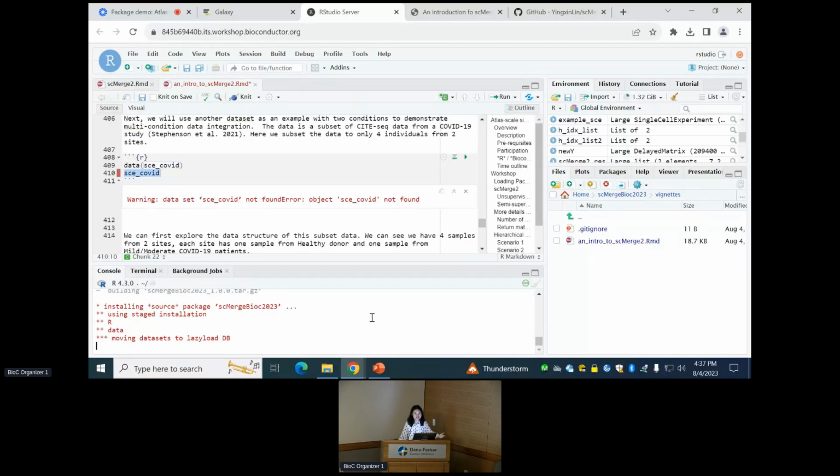But if it's not successful, then you will have an unwanted variation cluster in your merged dataset. The algorithm has two components trying to estimate the unwanted variation, and they do it jointly. If one fails, hopefully the other one will come and save the situation, but not necessarily all the time. So it's very data dependent.